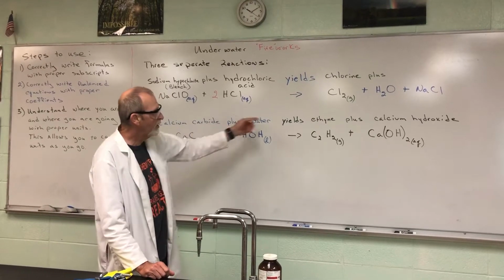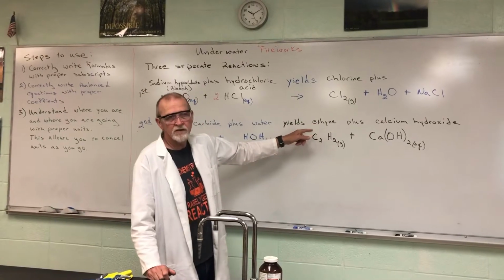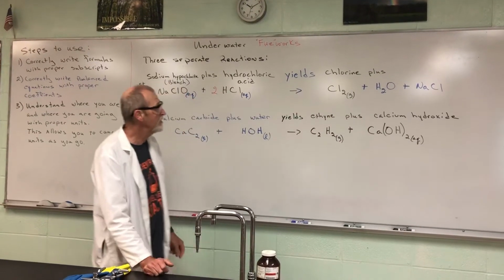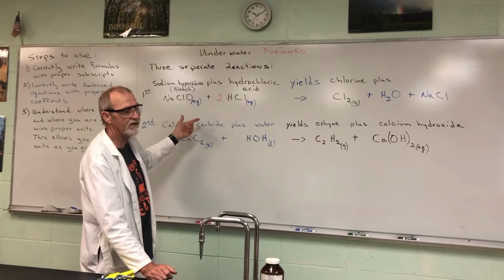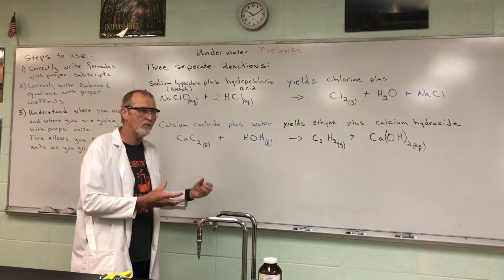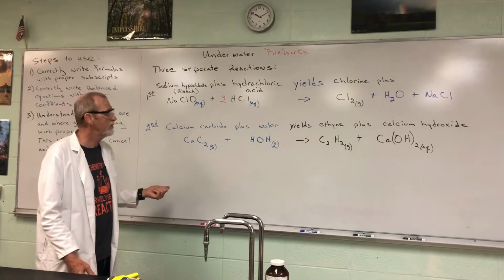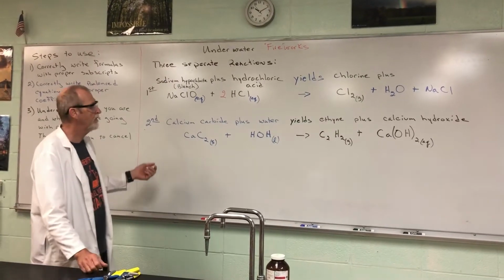So we've got a word equation. We didn't use the term acetylene this time. We used ethyne to tie into a little bit of the stock system that we were studying. We have a separate reaction, and the unique thing about this is it's very random. The bubbles, as they come together, will ignite, and this is pretty unique because this occurs at room temperature. We don't have to create any extra heat for it. Room temperature is enough for it to occur.